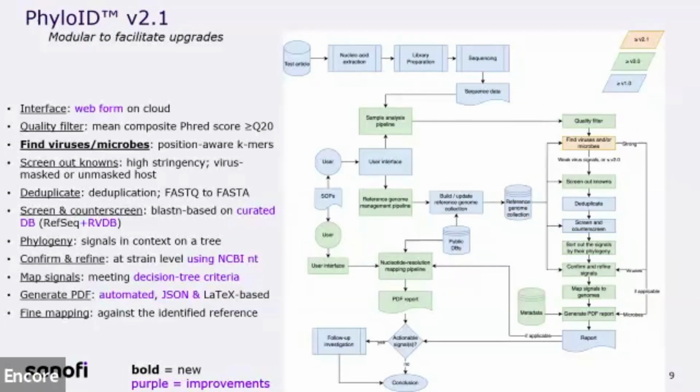And the talk before last on K-mers showed us just how powerful they are in terms of speeding up the pipelines. Now, we knew about K-mers, obviously, because we use them for the phylogenomic distance matrices, but I was not happy putting K-mer identification in the pipeline because of the variability in the viruses. They have too many false negatives.